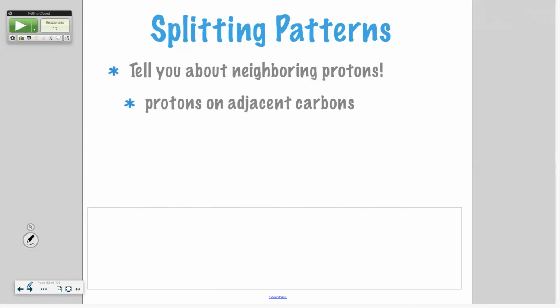If it's unaligned, it's going to subtract a little bit. So you would not look like a singlet like we saw on that last slide. You would be a doublet. That's how we get splitting patterns, by the protons on the adjacent carbons, and it's all the possibilities.